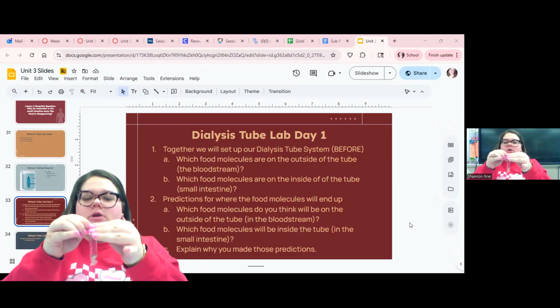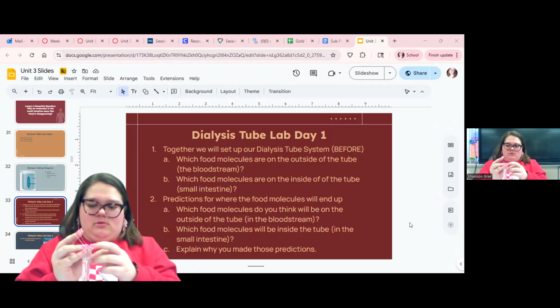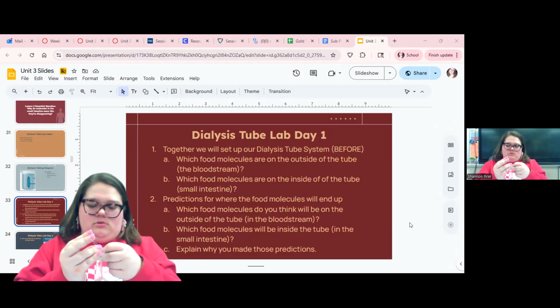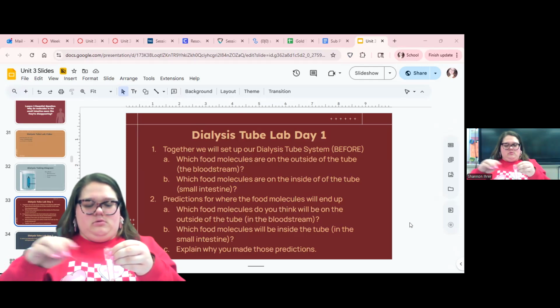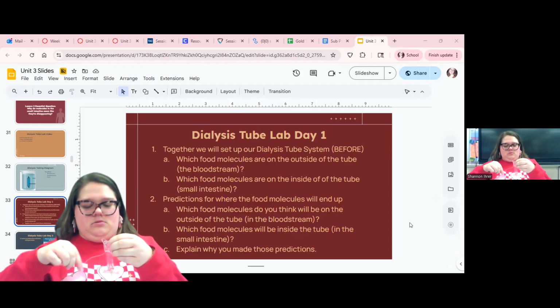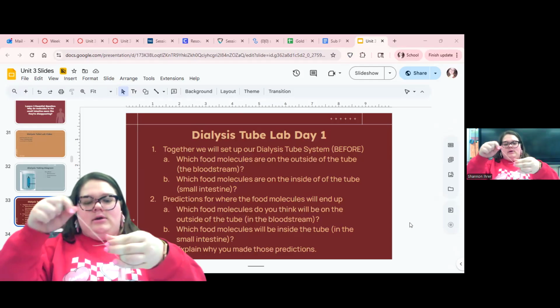We're going to fold it back over and tie it.